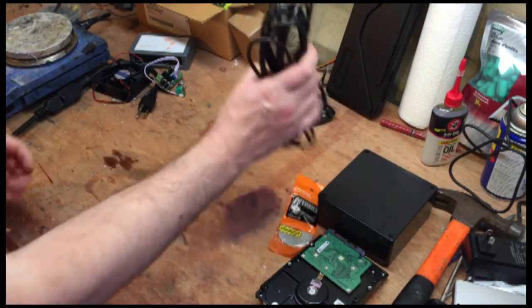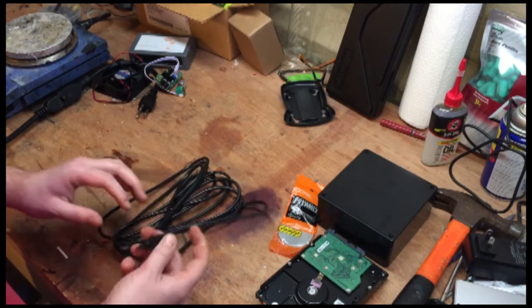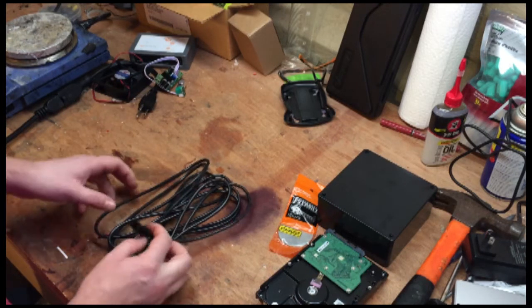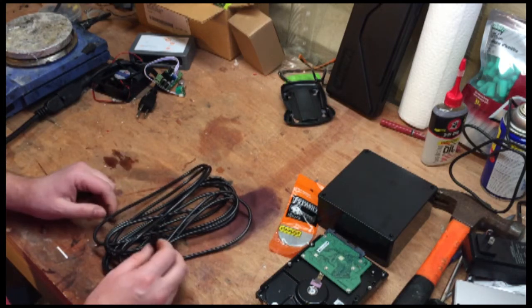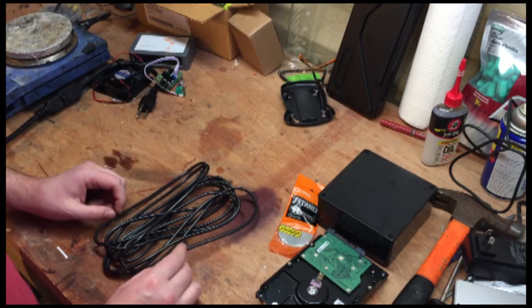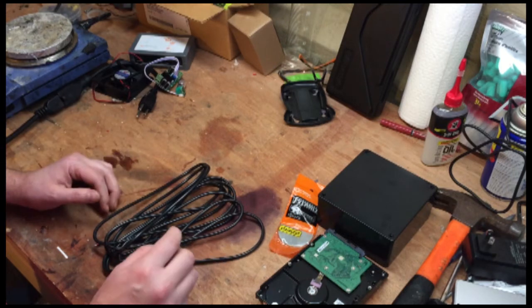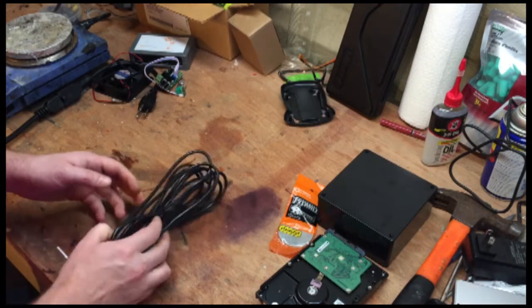The last thing that you're going to need is the 24 volt Apex cable, and I forget what kind of connection this is, but these are a little bit expensive at $18, but they're nice, they're over molded, and I think it's worth it. If you don't want to spend the $18 on the cord, you can build one yourself for a couple bucks, but it won't be as nice. But to do that, I'll put the links in the build thread down below.